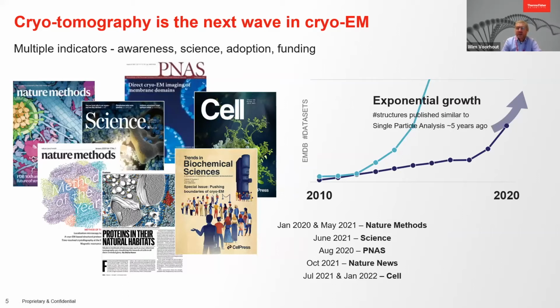And if you compare that to the number of publications and EMDB data sets, it's comparable to what happened to single particle, let's say 5 years back. So we see a steep increase in the number of publications using cryo-electron tomography.